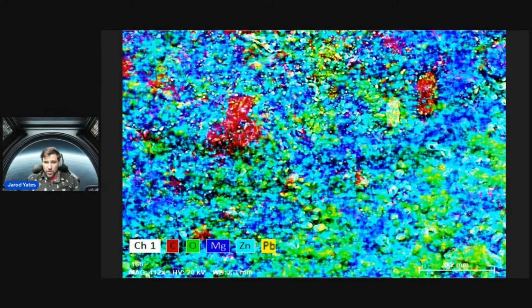So the yellow, that's the lead. The AARO report, the Oak Ridge National Lab report, said this thing has about similar parts lead to bismuth, and stopped there and said, so it must be slag. I strongly contest that you should just stop questioning this because you detected lead in it. And here's why. We can see these microspheres, right?